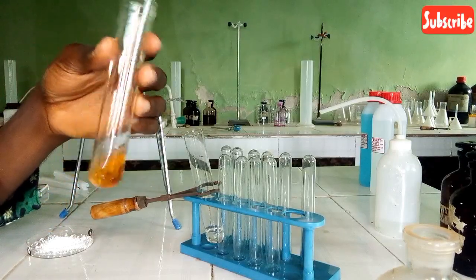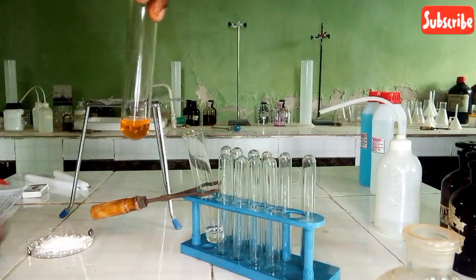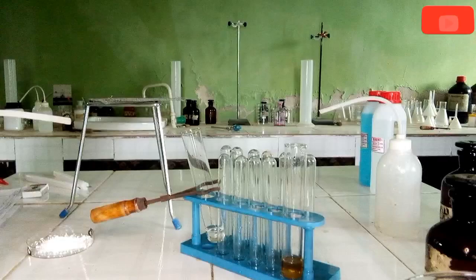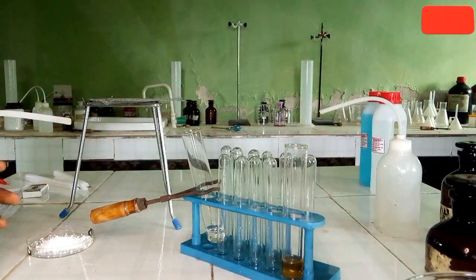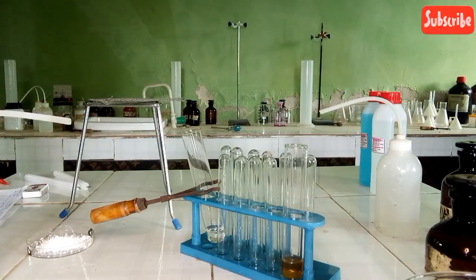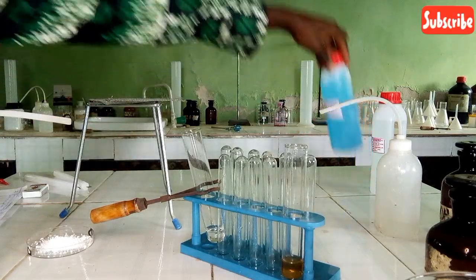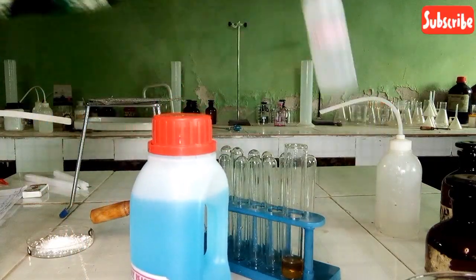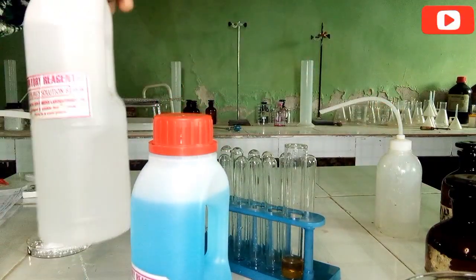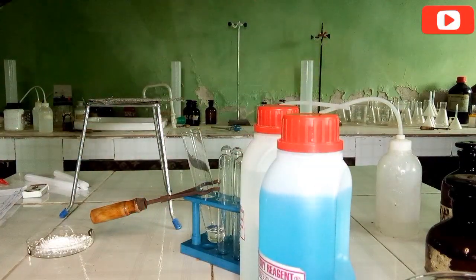So what do we notice? I didn't see a quick change in this, so let's keep it for a while to see if there is any change while we proceed with other tests. So now the next test is aqueous solution of C plus Fehling's solution. This is Fehling A and this is Fehling B. Fehling's solution, we are going to add these two solutions to it.